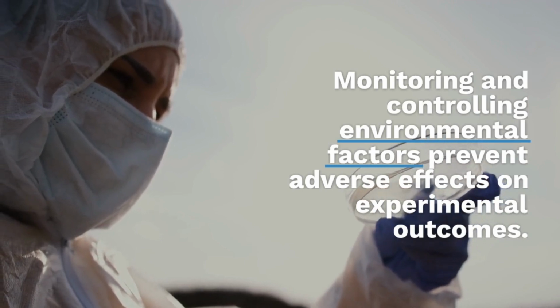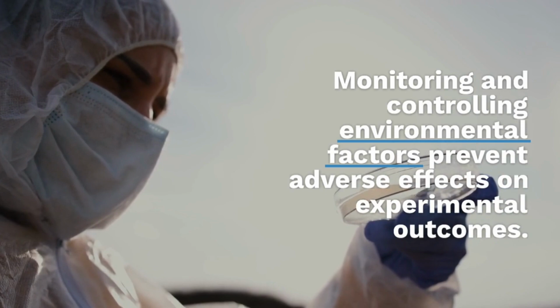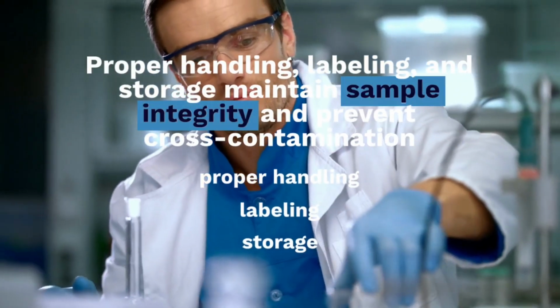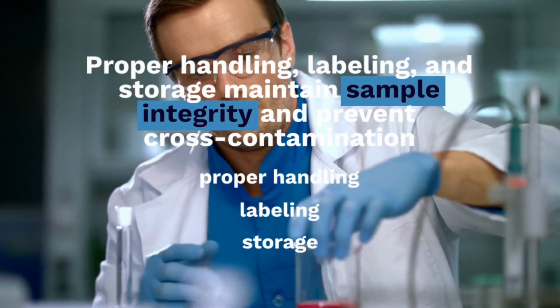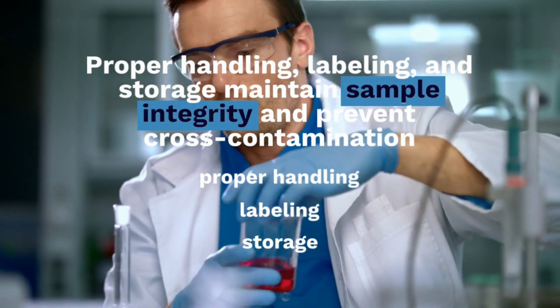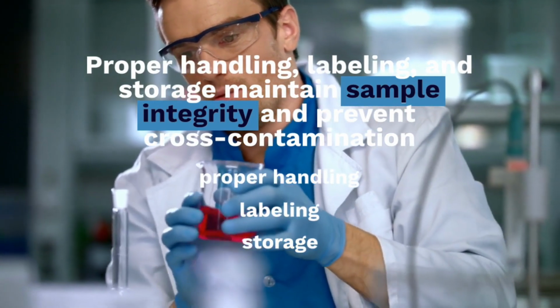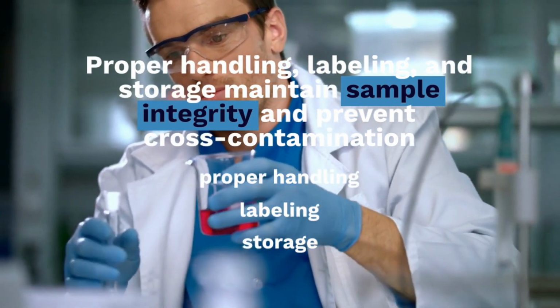8. Environmental controls. Laboratories often have specific requirements for temperature, humidity, lighting, and cleanliness. These environmental factors should be monitored and controlled to ensure they do not adversely affect experimental outcomes or the stability of reagents and samples.